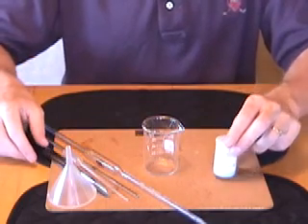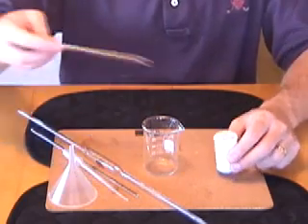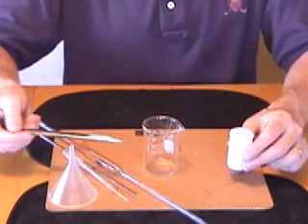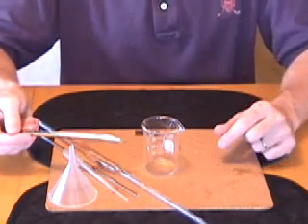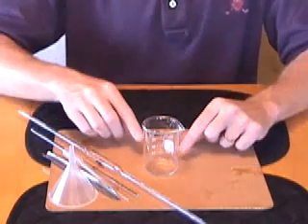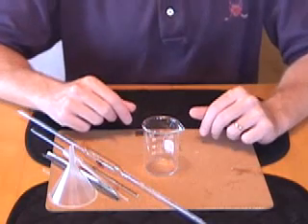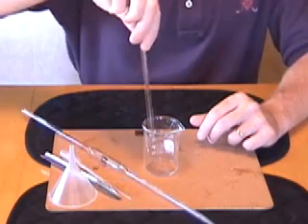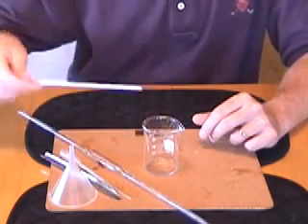So we'll weigh out a certain amount of copper 2 sulfate using a spatula, of course, to be able to transfer it perhaps into a beaker right away that has been tared on an electronic scale. So once you've got your solid in there, you want to dissolve it into some water. So you'll pour some water in, stir it up with a stirring rod. Let's say you want to make a 100 milliliter solution.